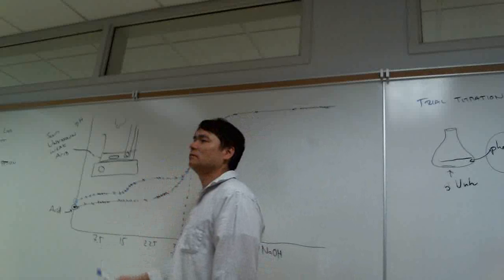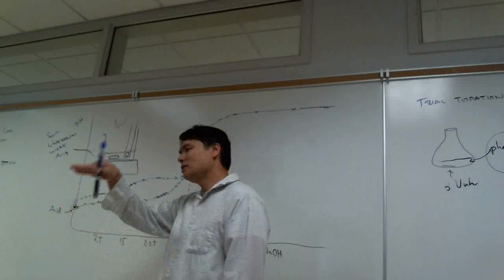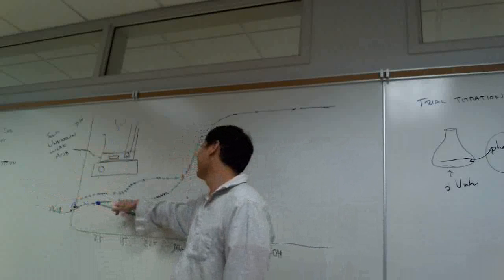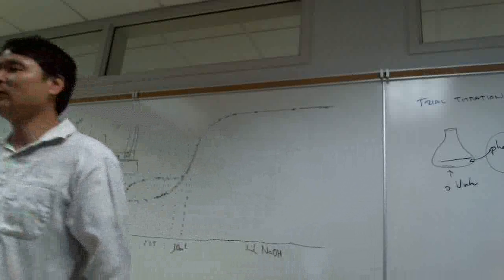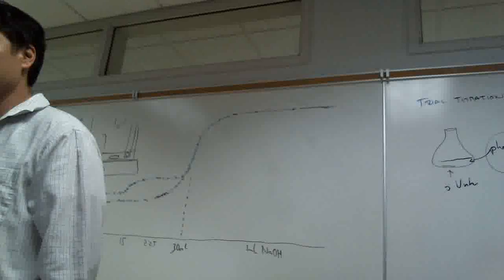So the different pHs that we reported, you can visually see it. What's happening around 15? Is it staying flat or is it increasing? You could easily see it, even before you graph it. You'll have an idea.